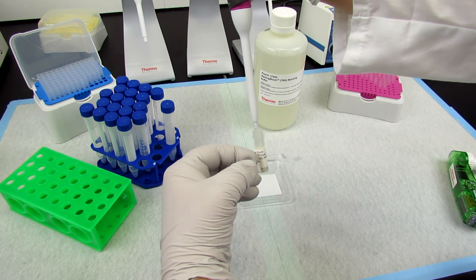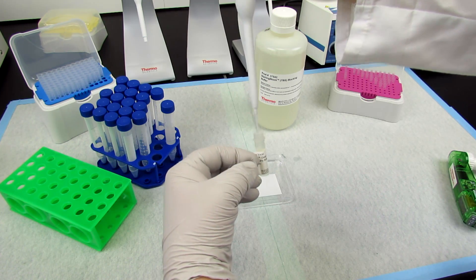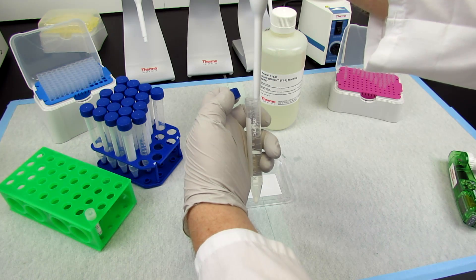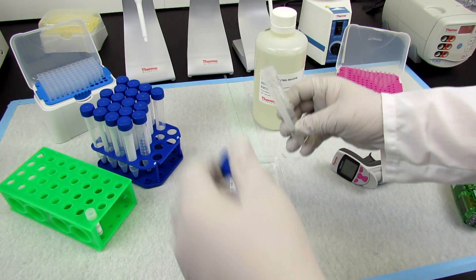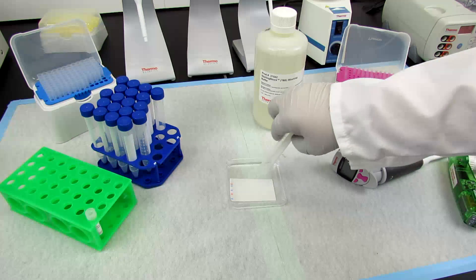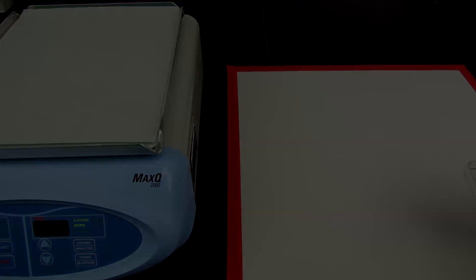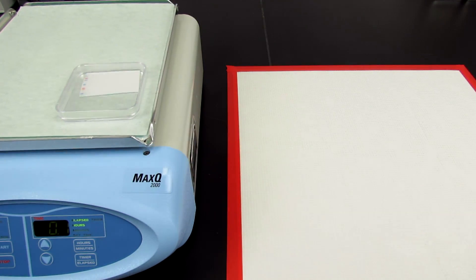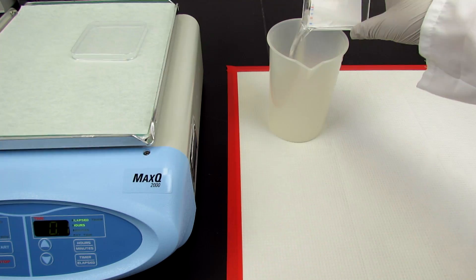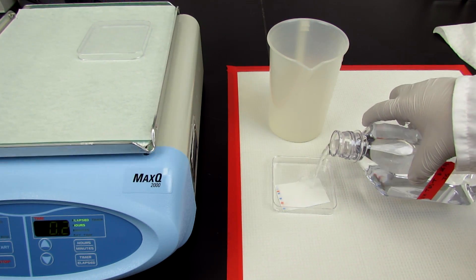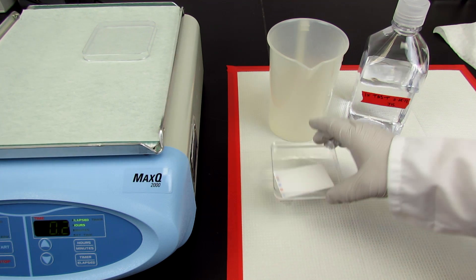Then dilute the secondary antibody to an empirically determined ratio and add it to the membrane. After incubating for one hour to overnight, wash the membrane three times and it will be ready for the detection step.